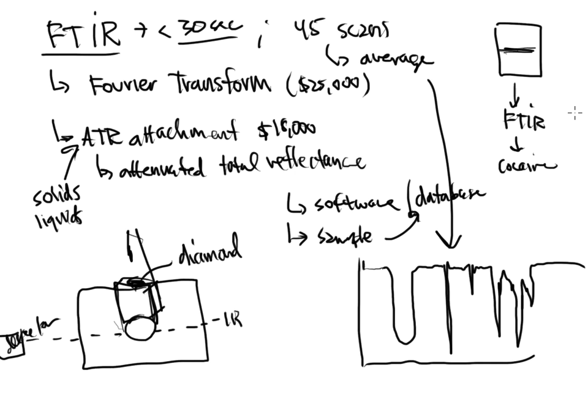Well, again, we've got a complicated mixture maybe. A complicated mixture comes into the lab. How would it behave on an FTIR? Well, you're going to see some problems with something that's very complicated. But for the most part, if it's a pure compound, there's not a lot of components with it, or if one is in higher concentration than the others, then we're going to see no problem at all using an FTIR to identify a solid or a liquid. It doesn't really matter which one it needs to be. The power of the software, the database, the ATR, all works hand in hand.